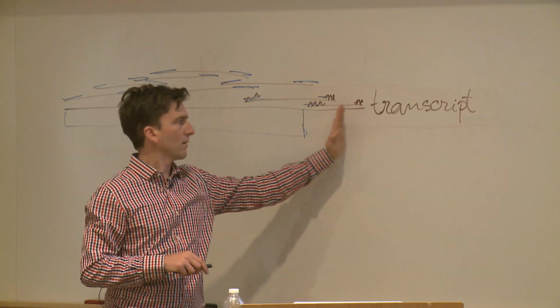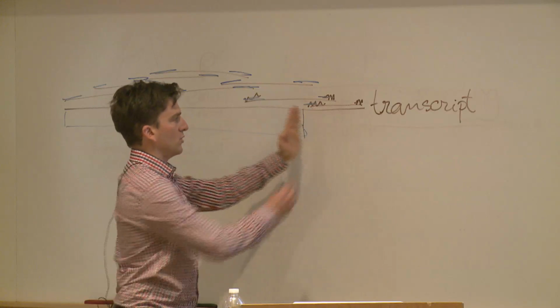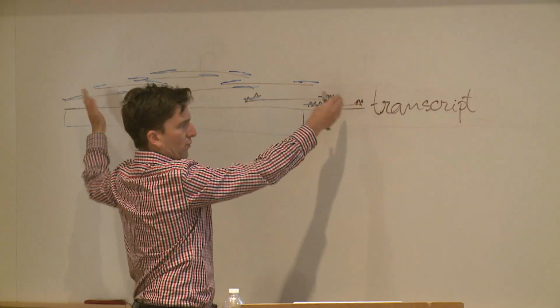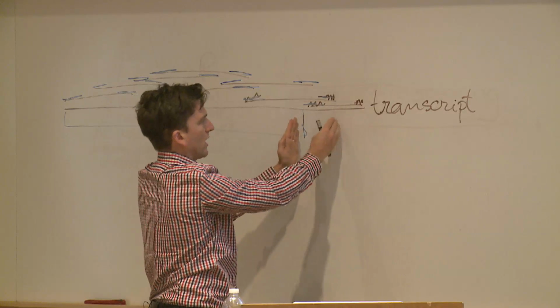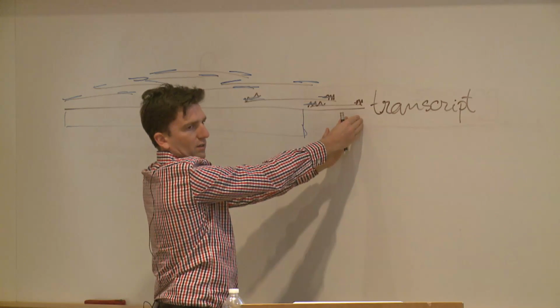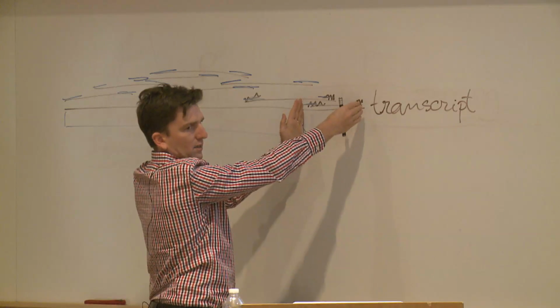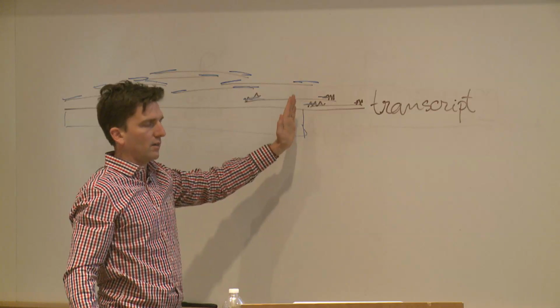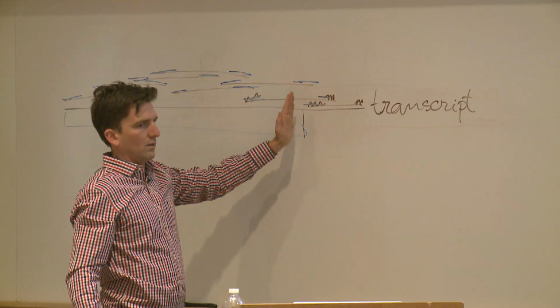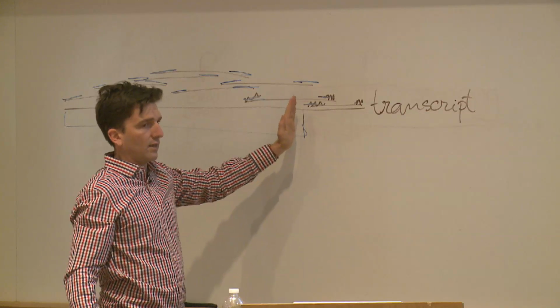Oh, I see. Is that because that would make the fragment too small? Well, because you have this transcript, you fragment it, and then you sequence. Right. So you can't have a fragment that's here. If you fragment it, the fragments are that size, and so that has to be the last position. So that depends very initially on what was the average size of your fragment. Exactly.